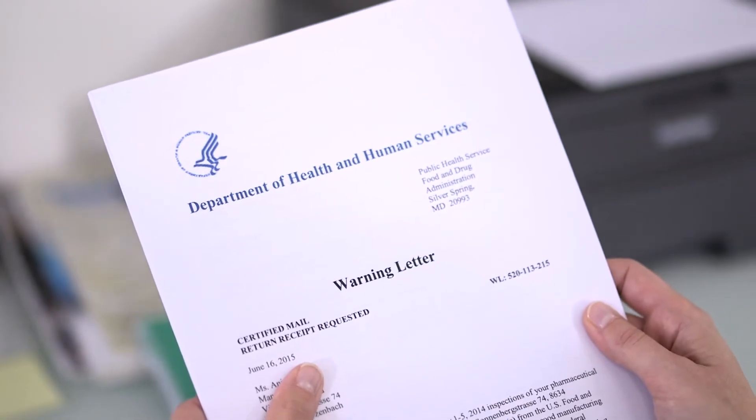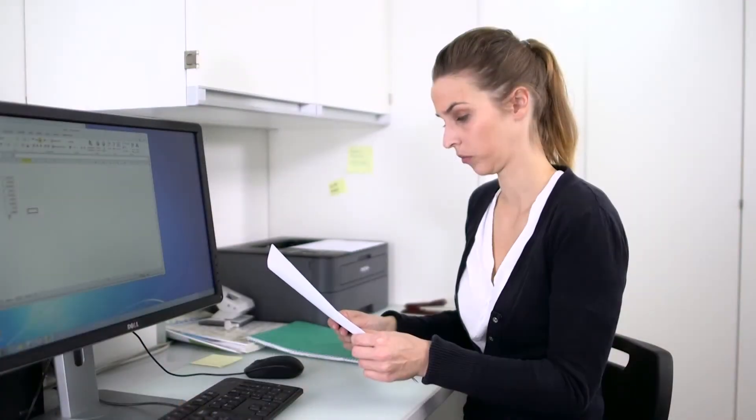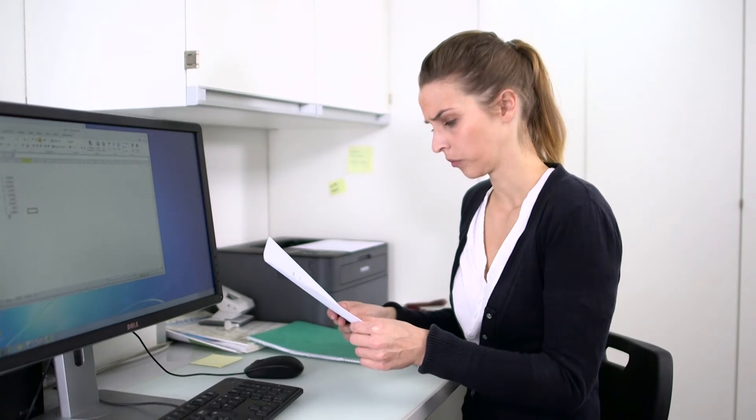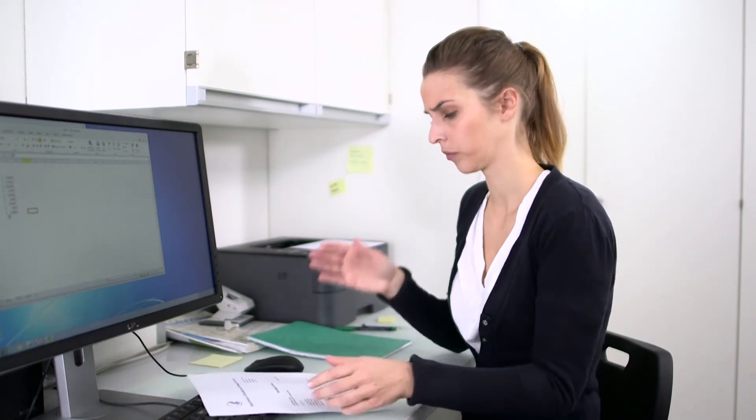A common concern of labs under regulation of FDA and others is a warning letter where an inspector has found violations. Remembering back, how does such a thing happen?